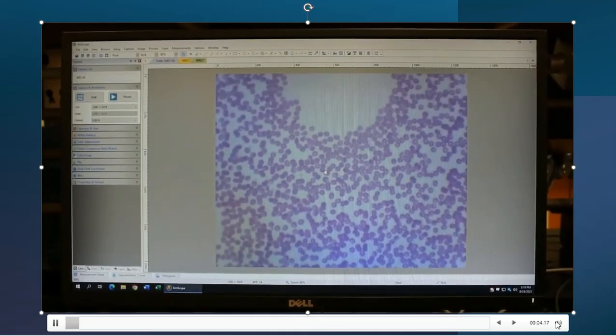All right, guys, so now we need to do the highest magnification power, and keep in mind that one is a little bit longer. So what I'm going to do first, before I turn this around, I'm going to go over to my microscope and grab the button, and I'm going to lower the platform down just a little bit, because I have to. If not, that lens is going to crack up against the microscope slide. So I'm going to take the big adjustment knob and lower that down away from the lens just a little bit, just a smidge. It doesn't take a lot, but I need to get it away from that lens.